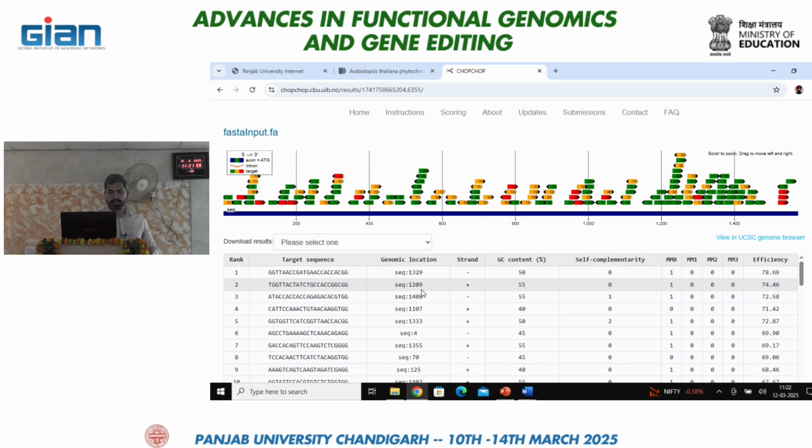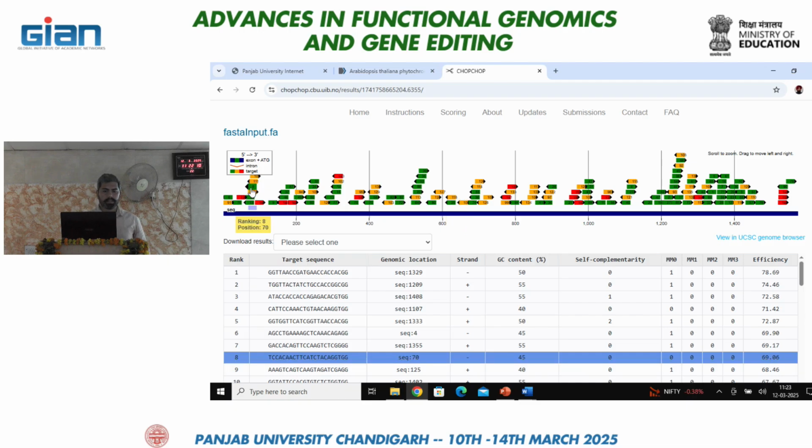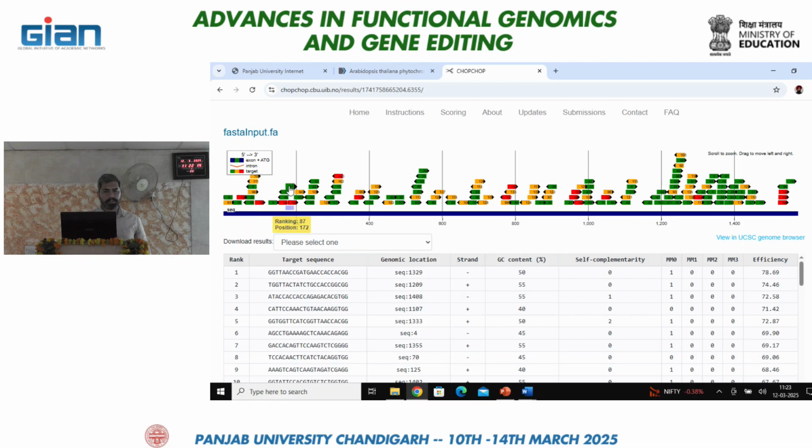So you will get the result something like this. This is the graphical representation. Here, these small boxes represent the target sites. All of them are target sites, and they are color coded according to their efficiency. All of you have gotten your results or not? Yes.